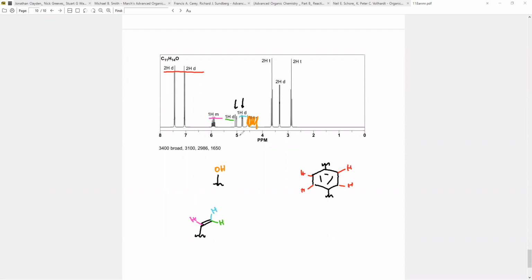I don't really care which one's which, honestly. I'm pretty sure it's that, but whatever, it doesn't matter. Okay, and we talked about this: if there's any hydrogens at this position, they would show up at 2 to 3, the alpha region. They would also look kind of messy or complex, because they're interacting with a diastereotopic structure. So if I just look here in general, those are the only peaks I have left. I'm looking for a peak that doesn't look very good. I see a peak that's like Schrodinger's peak.